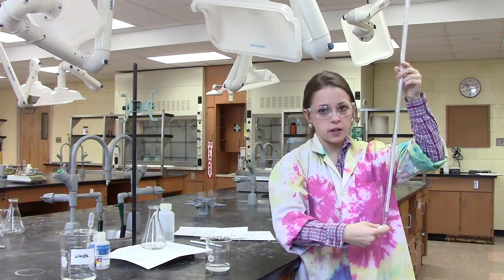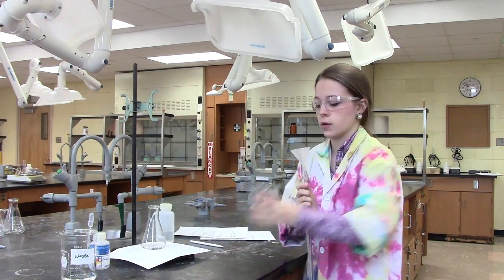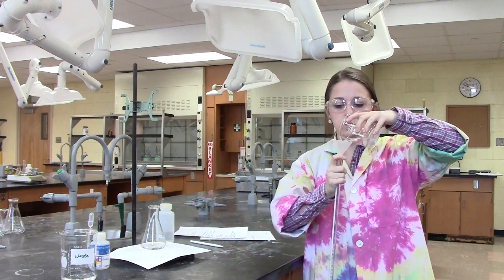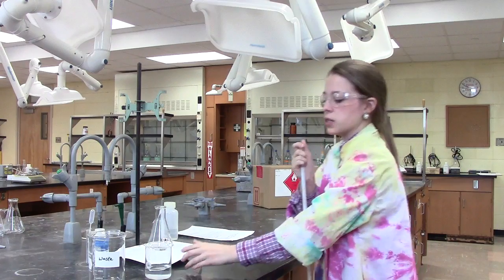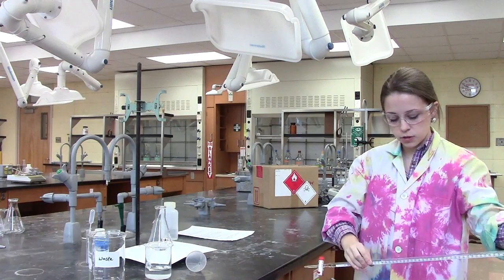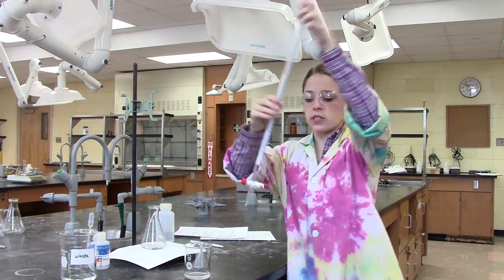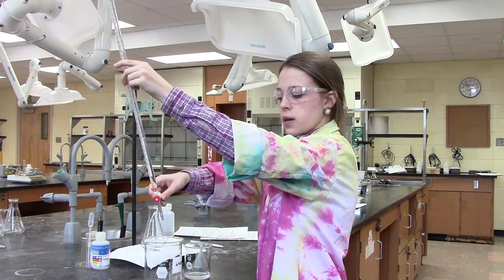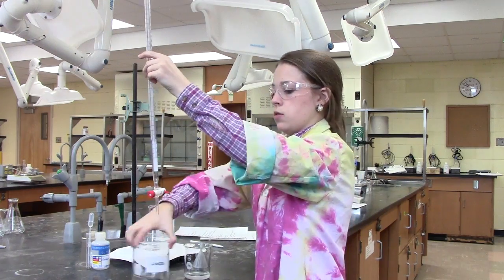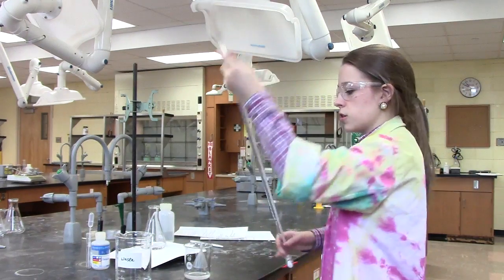It's important that before you pour in the liquid, you ensure that the stopper is turned perpendicular, as that's an indicator that the stopper is closed and no solution will flow through. Start by using your funnel to pour in some solution. Once some solution is poured, we just turn the burette horizontal and allow the solution to reach all sides of the burette. It's very important that we turn the tip parallel so that we can rinse the tip as well. Once the burette is sufficiently cleaned, we can pour out the remaining solution into a waste container.